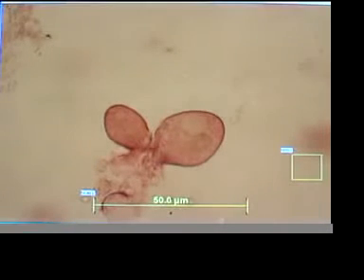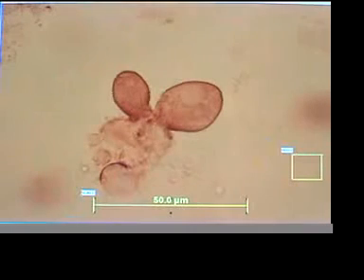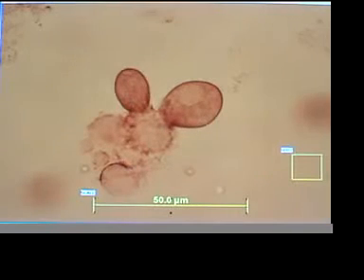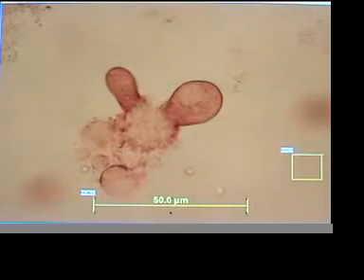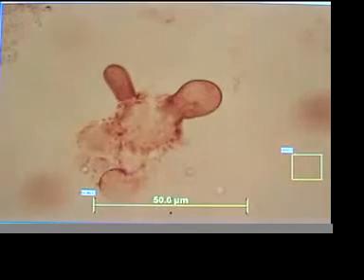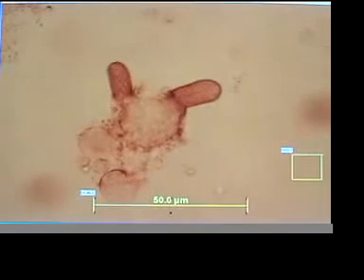Oh, a double hit. Double devitalization. Fantastic at 929 hertz. Both organisms going at once. Very rare to catch on video. Look at that. Fantastic. Let's give it a little red filter and look at some of the texture.